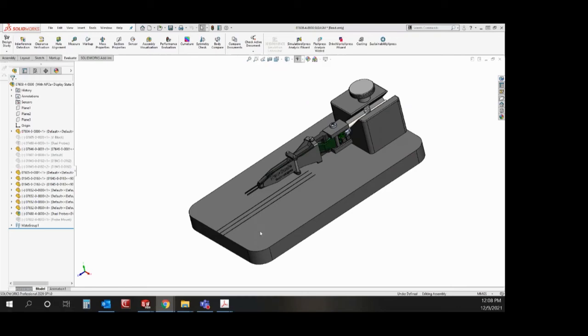And here we are introducing our new probe mount for NeuroPixels 2.0 probes alpha phase as well as our accompanying alignment fixture to aid in installation and alignment.